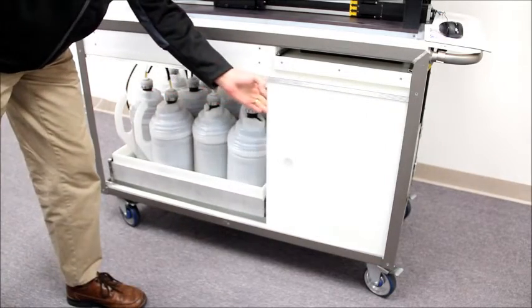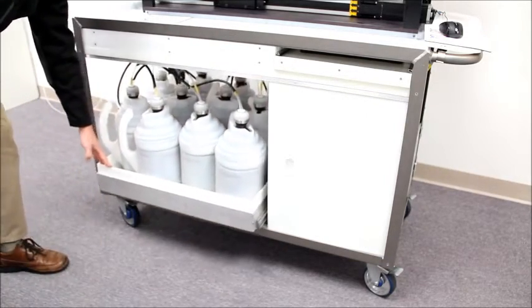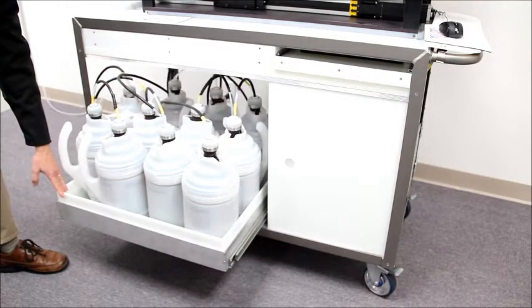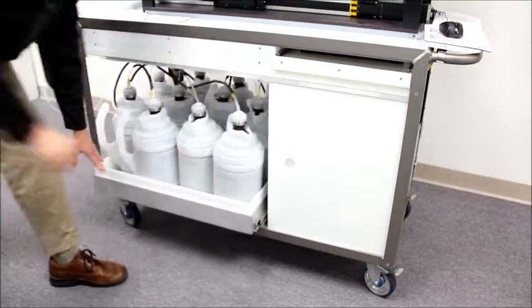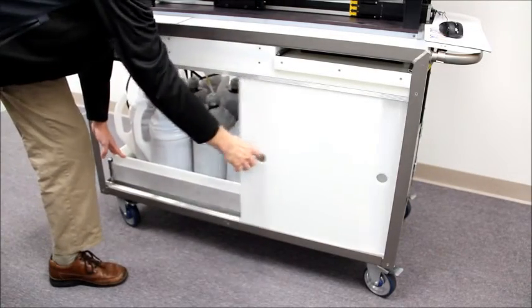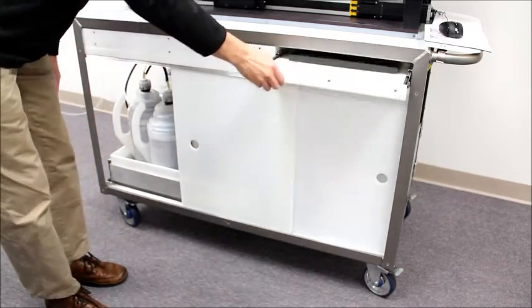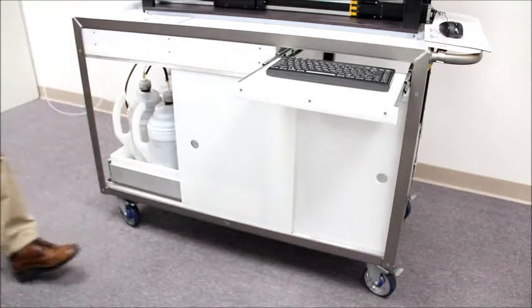Also on the lower shelf is a pull-out tray containing the large reagent bottles and the waste container. There is also a pull-out tray containing the keyboard for the computer.